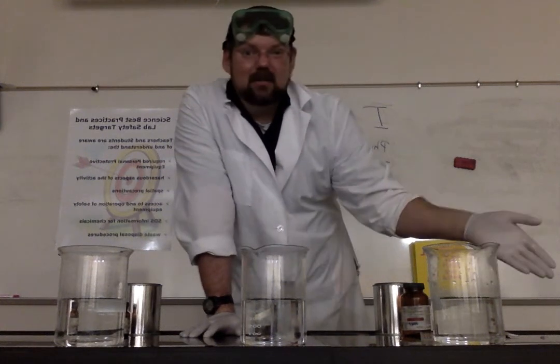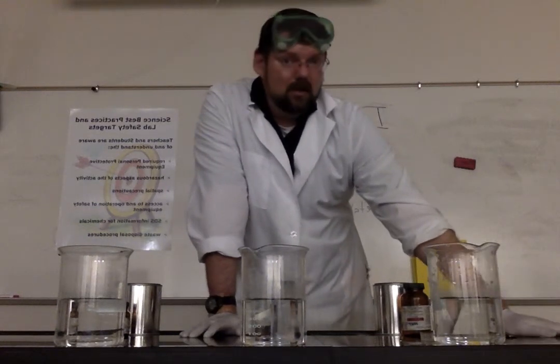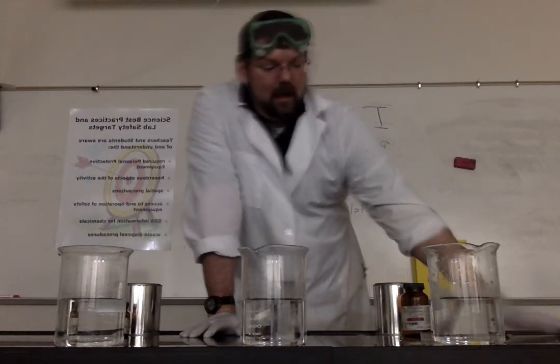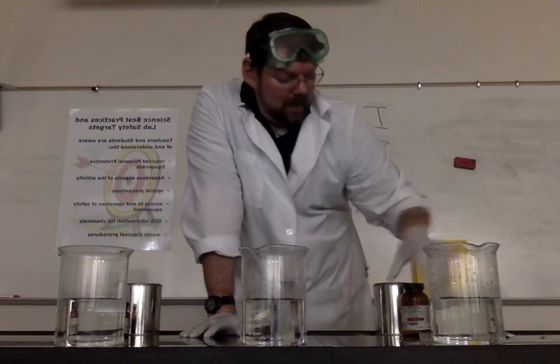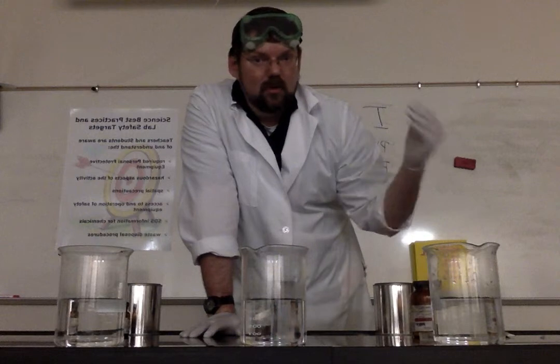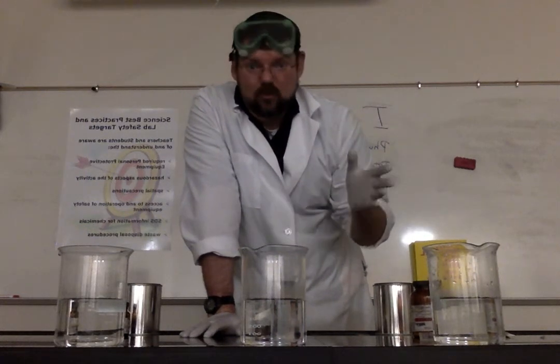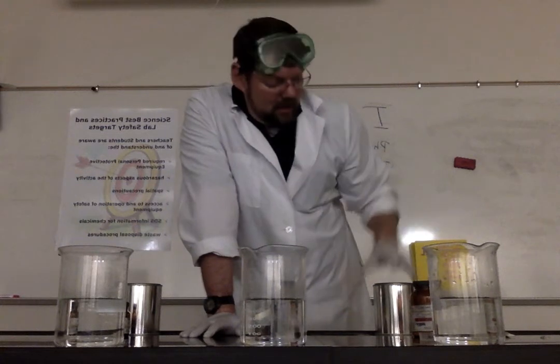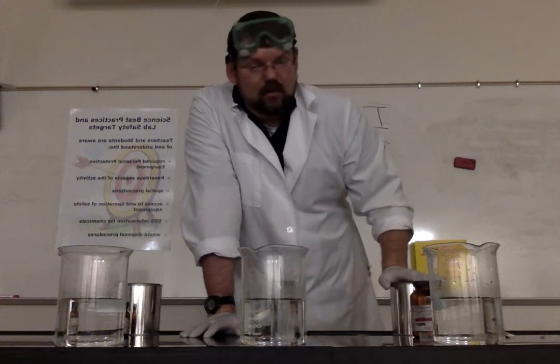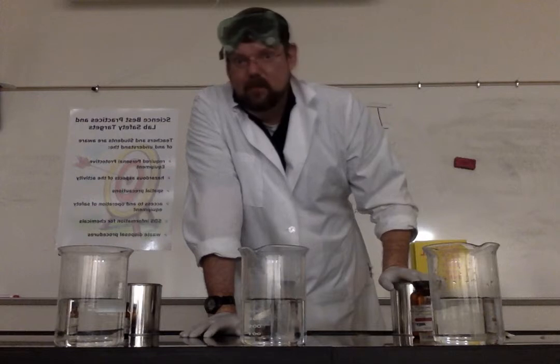We have special containment systems. We're able to put this down the sink as long as we dilute it. So that is the plan for these materials. Anything that's left over gets put back into the containers where there's an oil so that it's not exposed to any kind of humidity, or I get a big boom in the storage room. Also, these are kept in a can that has sand inside of it, so that any kind of excess water is actually trapped that way as well. So we're covered on all ends.